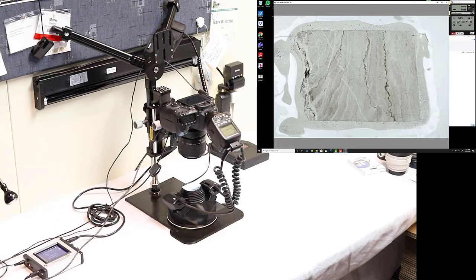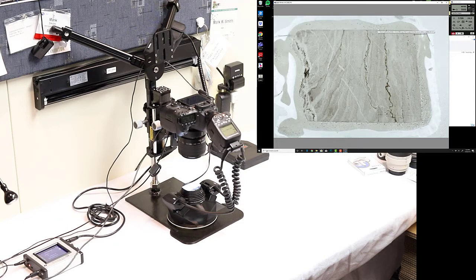What this is going to give us is a 20 photograph stack through a slide or a thin section. If you have a slide of anything, it could be an ant, a wasp, any histological slide, rock, this is how you're going to be doing the majority of your imaging. But if you have more sophisticated analysis, if you're dealing with rocks and minerals, you want to add a second polarizer in order to cross-polarize the materials. Biologists might not be very familiar with this technique, but geologists will be. It's very common in the geological sciences, pharmaceuticals, and metallurgical sciences.